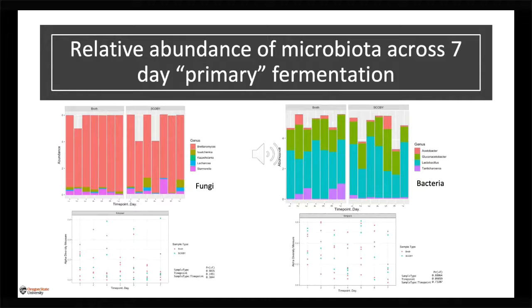From there on, we're able to visually assess the microbial composition over the course of these 7 days, and we're able to calculate alpha diversity and beta diversity, although beta diversity was not shown, to really look at microbial diversity or microecology with statistical strength placed behind it.